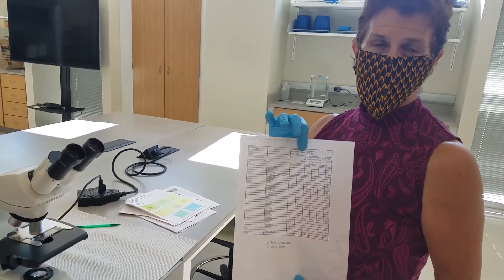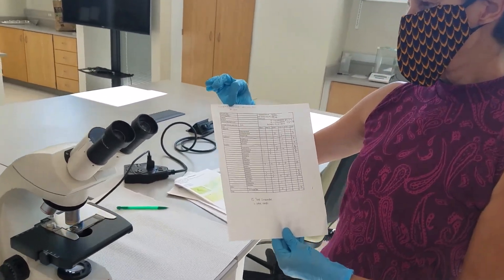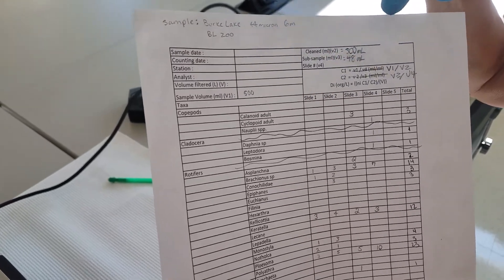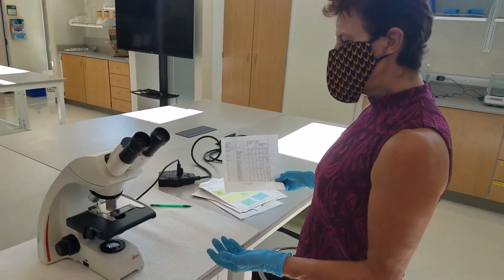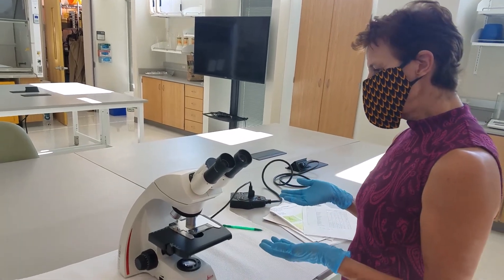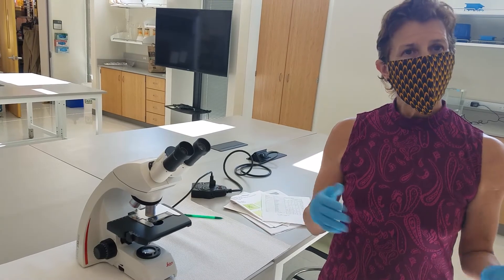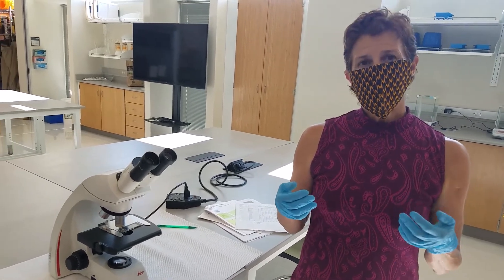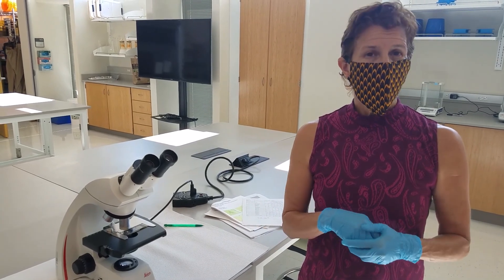This sample assessment sheet is your final input, where this individual has taken — for this particular Berkeley sample at six meters — four processed slides and combined them into one. They took the tally marks and converted them into numbers. You go across the slide IDing and counting until you've completed the entire slide, which pretty much completes your processing of the sample in the lab. You'd then rinse everything off. Hopefully you'll have time to do two or three of these in the lab — there's a big learning curve at first, but once you've figured out the dominant taxa in your samples, you can move through them quickly.